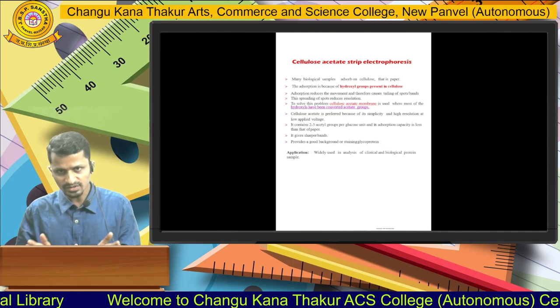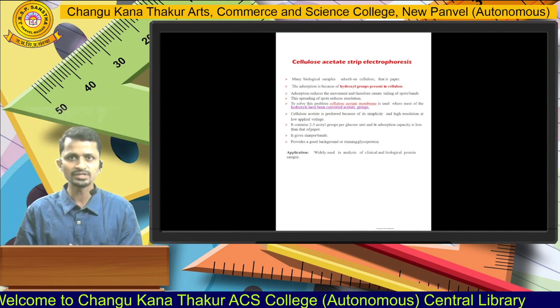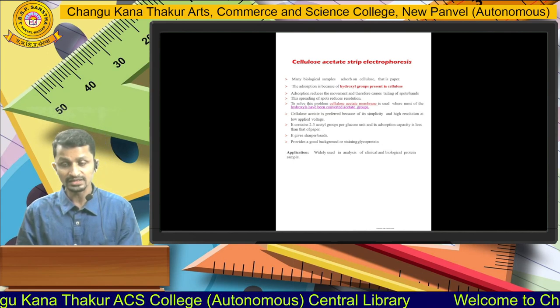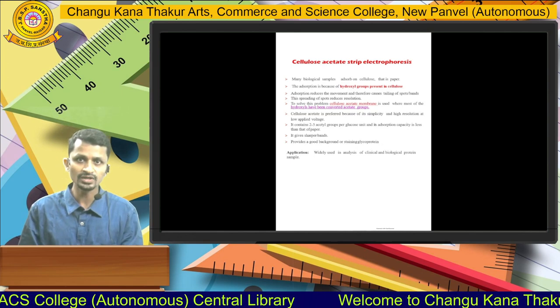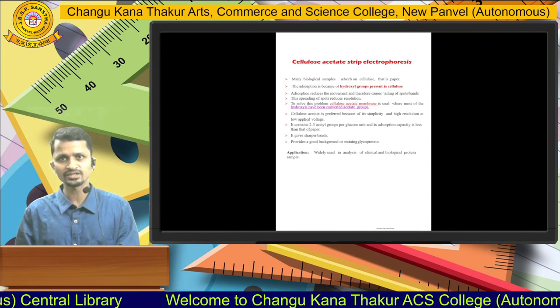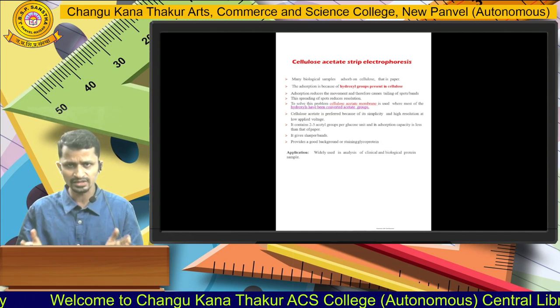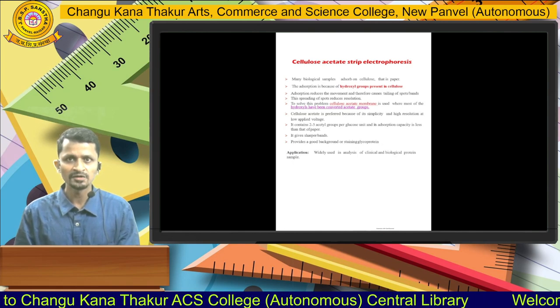Because of this, as the hydroxyl groups are removed, the separation takes place properly. Good resolution is obtained, that is, a high resolution is obtained even at a low voltage supply. So this is the important application and advantage of the cellulose acetate strip electrophoresis technique. And this technique is also widely used in clinical and biological fields.